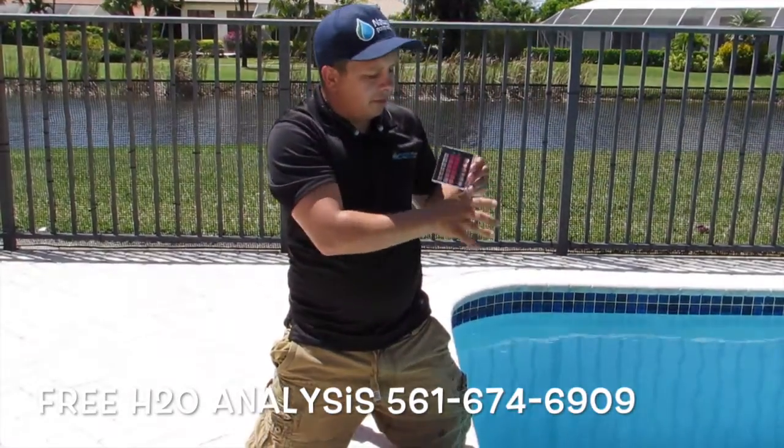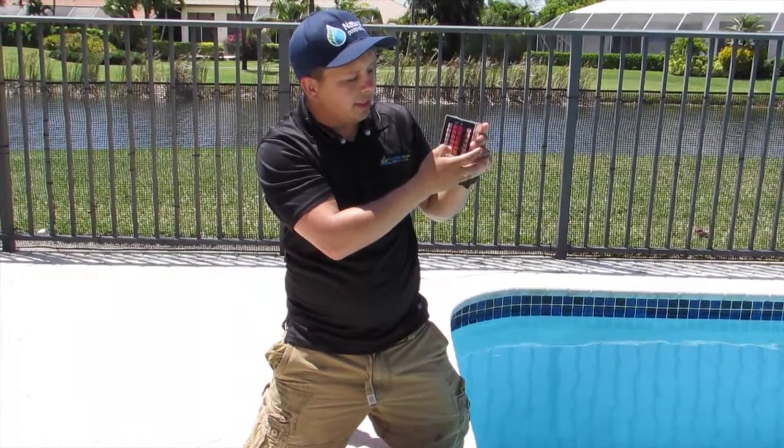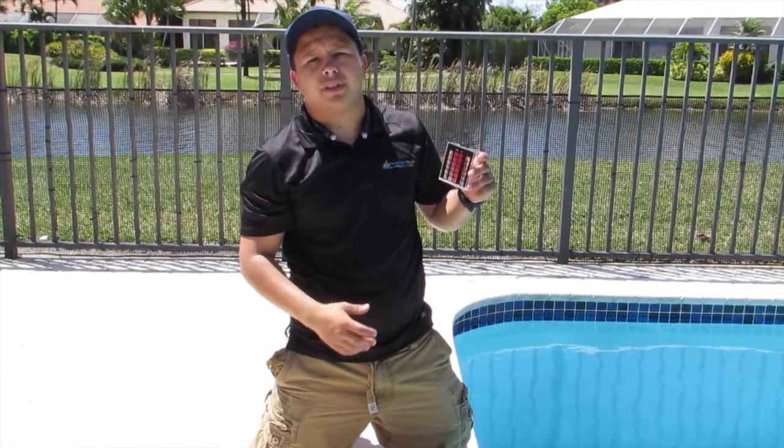On the front of the block it has a reading. What's required by the health department is anywhere between 3 and 5, which is the requirement. Right now there's no chlorine.